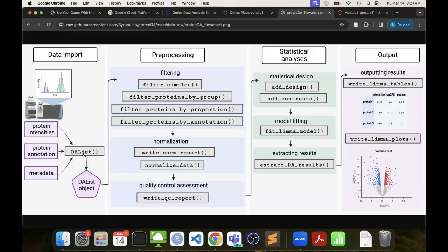So there are different data types in R. You have factors, numbers, strings. So you have to tell your program what your characters are.